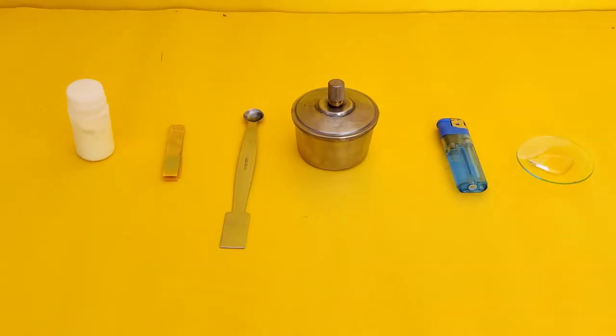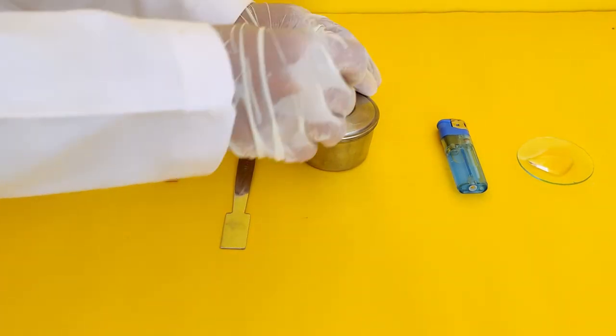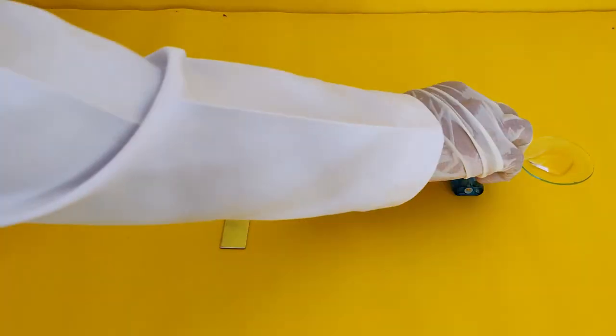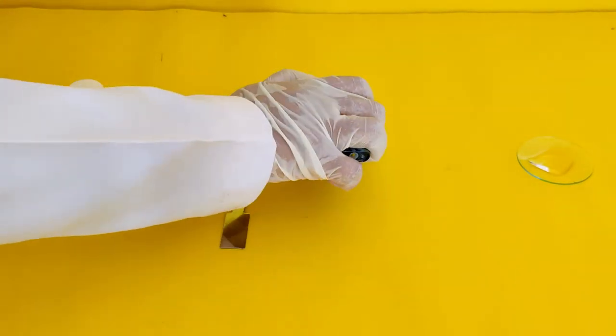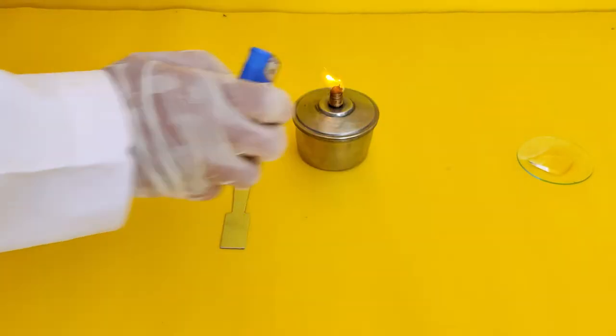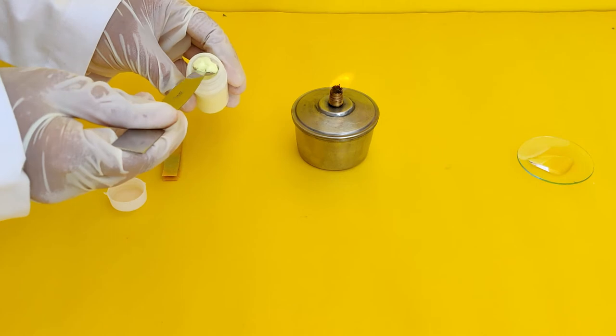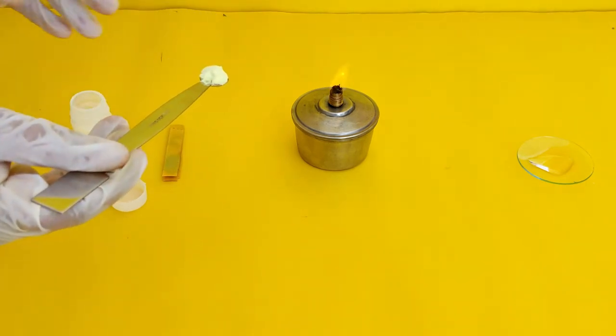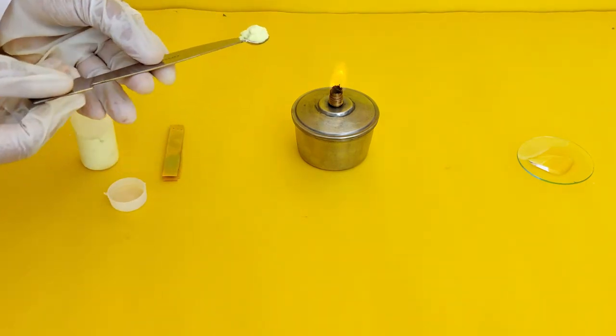To determine the pH of sulfur dioxide, we will heat some sulfur in a spatula. Light the spirit lamp. Take some sulfur in the spatula. Hold the spatula over the flame.